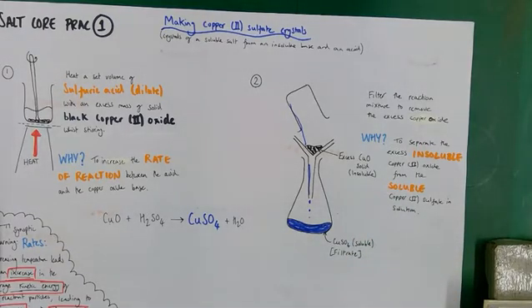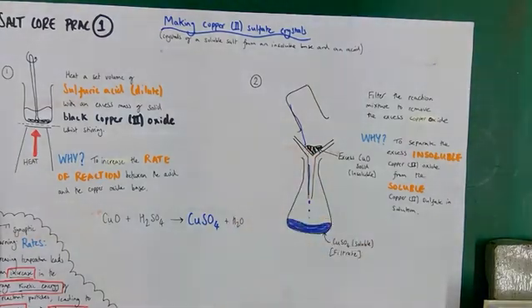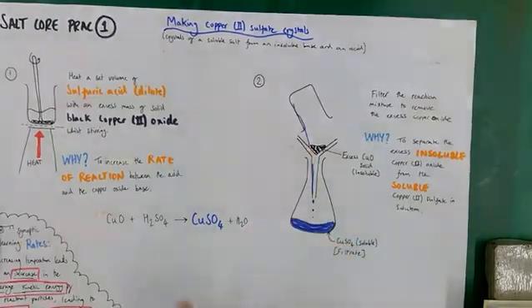This gives us pure copper sulfate solution without solid, which is better for getting pure crystals. Collect the filtrate and discard the residue—the excess copper oxide solid left on the filter paper.